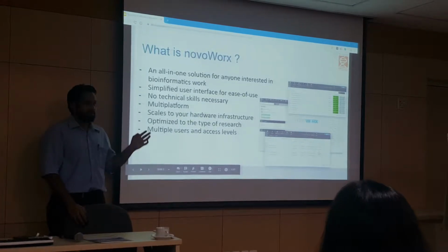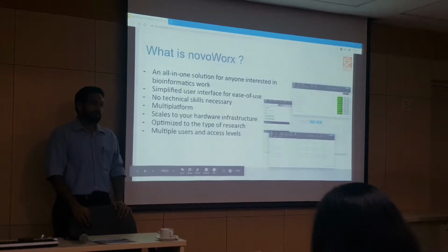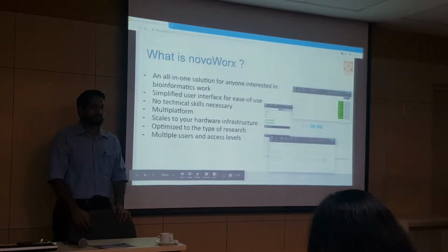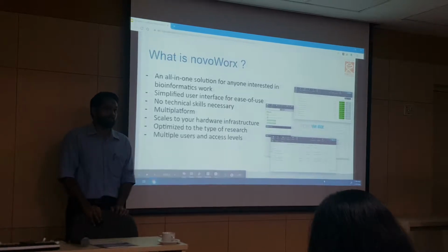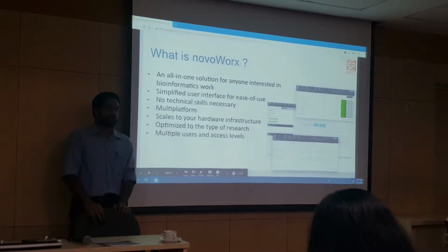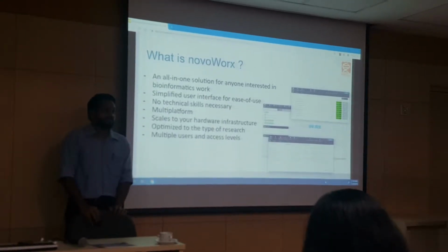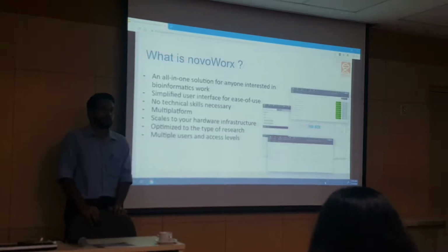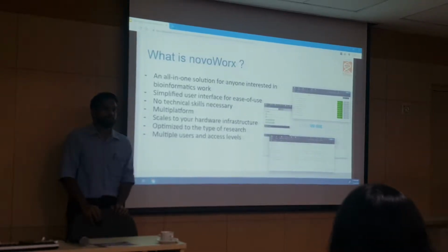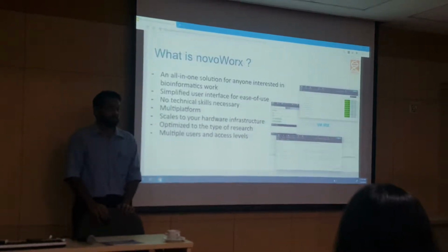We made it so that it's a local install, or you can do it as a cloud install. You can also put it into any kind of architecture, because we are basically using a virtual machine to run novoWorx. So as long as your system is able to run a virtual machine, you should be able to run novoWorx. There's very little setup necessary. You just have to download the virtual machine image, put it into your virtual machine manager, and you should be able to use it right out of the box.